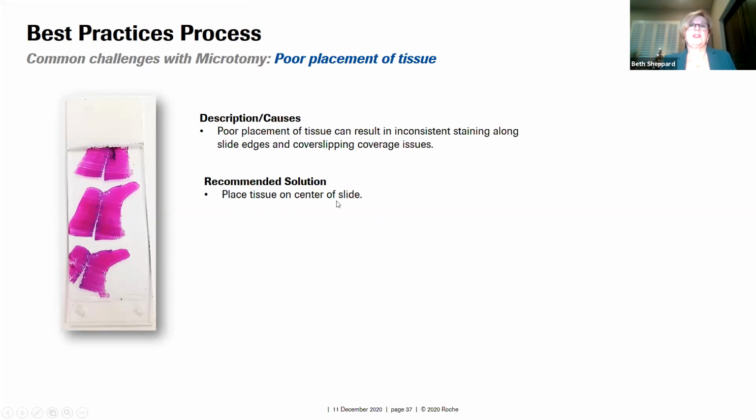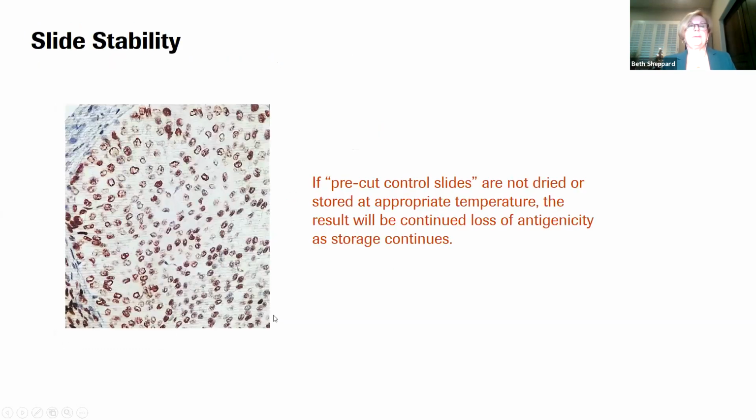So make sure you place your tissue in the center of the slide, and that it's easy for the pathologist, for digital imaging, and actually for the technician itself. I would suggest that you train your technicians in your laboratories that this is the way it should be done.